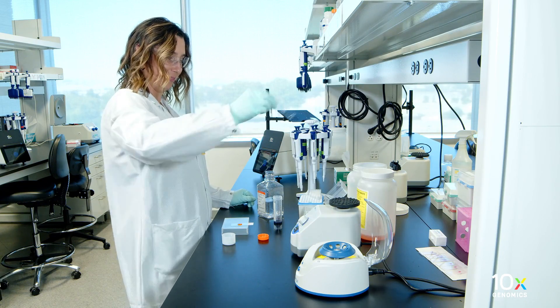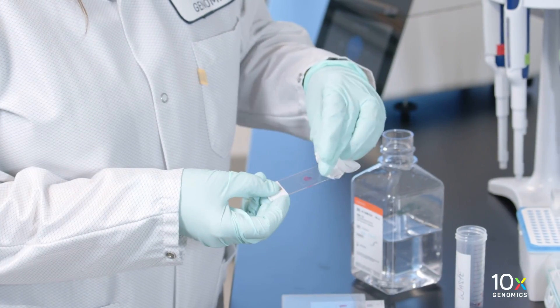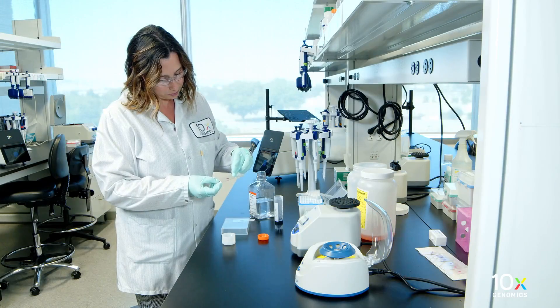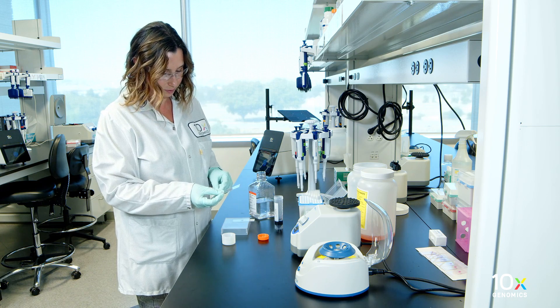Gently flick the slide back and forth to remove excess PBS. Remove any remaining PBS with a laboratory wipe without damaging the tissue sections. Wipe the back of the tissue slides with a laboratory wipe.